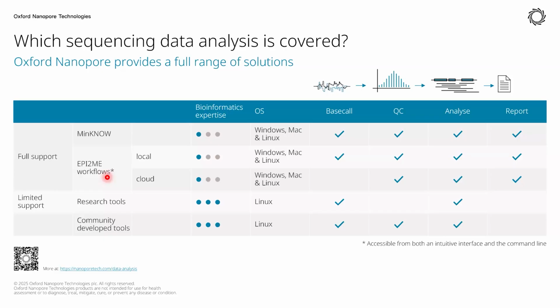Chris, I think you have a question. So the default data, they're aligned, yes, because you said it's optional. Sorry, I missed that. So at the end of the day, when you are running the default pipeline, we will have information about the genes and the counts and probably the BAM files. And all these are aligned to the latest genome, the 38, I'm assuming, correct?